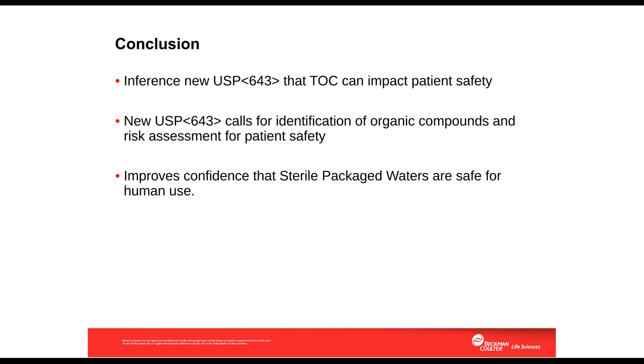And the change to the test for packaged sterile water in USP 643 is suggesting that the total amount of organic carbon per container is also a measure of patient safety, not just keeping TOC levels below a set concentration as it would be in bulk waters.